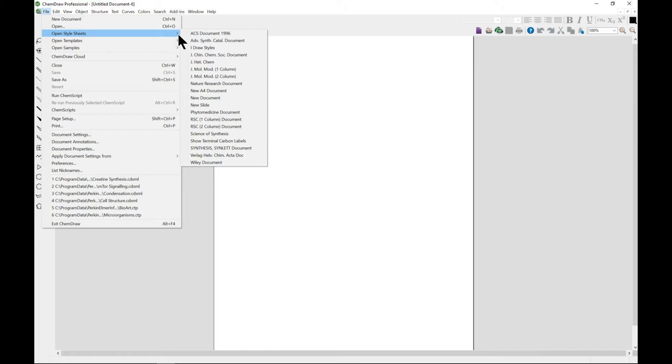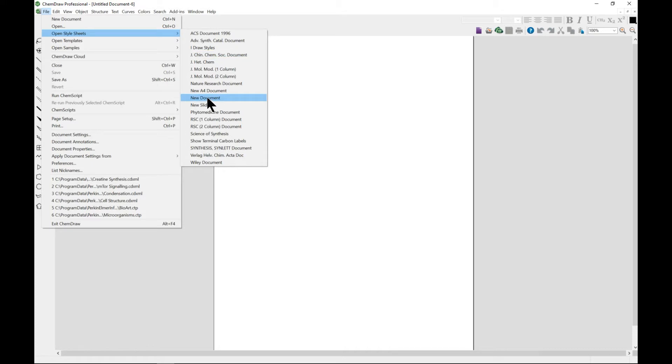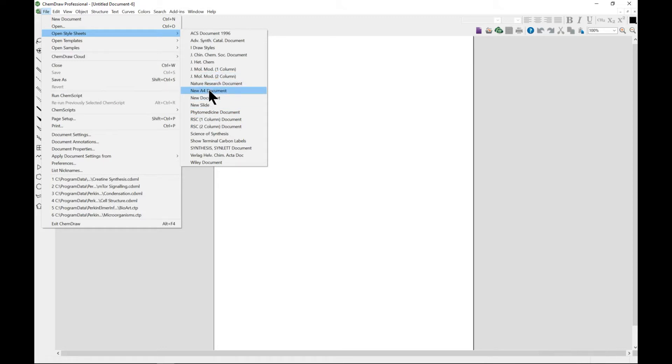You can see many kinds of documents that you can open, including New Document. Each one has different things that you do - different fixed length, bond width, line width, margin width, hash spacing, chain angle.